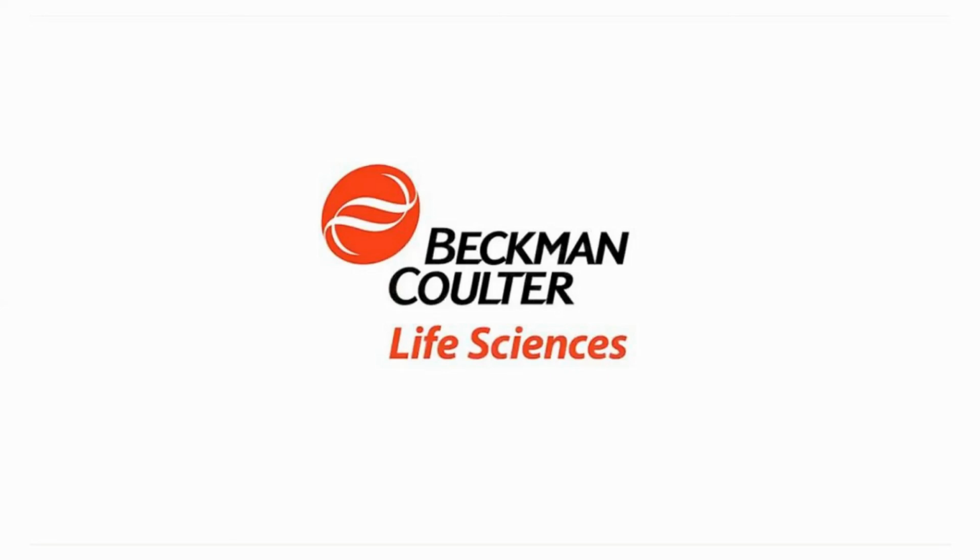Yeah, so on the systems, primarily, we're automating fixed and pretty well-established processes. We do have some flexibility in there, like I just mentioned, for the different types of samples and how we handle those on some of the systems. For optimizing protein purifications, as an example, we typically do that offline, using a lot of the same tools, ideally, and the same instruments, but we work out those details off these systems.